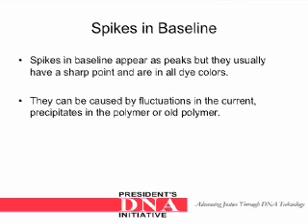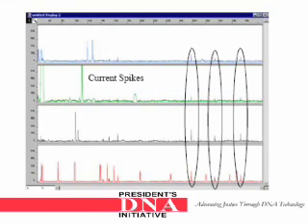Spikes in the baseline appear as peaks, but they usually have a sharp point and are in all dye colors. They can be caused by fluctuations in the current, precipitates in the polymer, or old polymer. Here is an example of spikes in the baseline: they tend to have sharp points and are present in all of the colors.